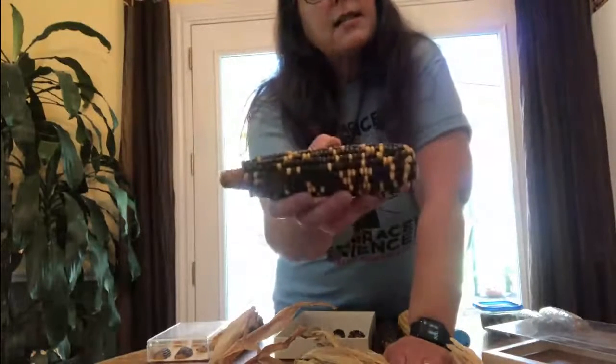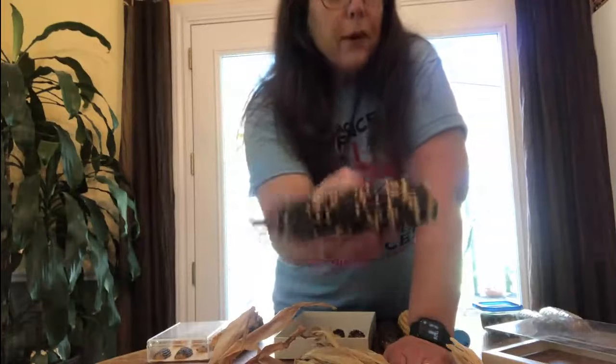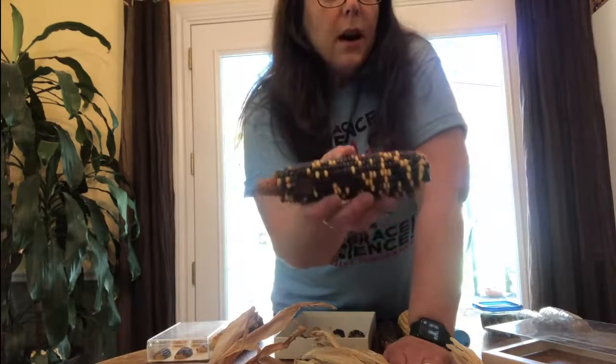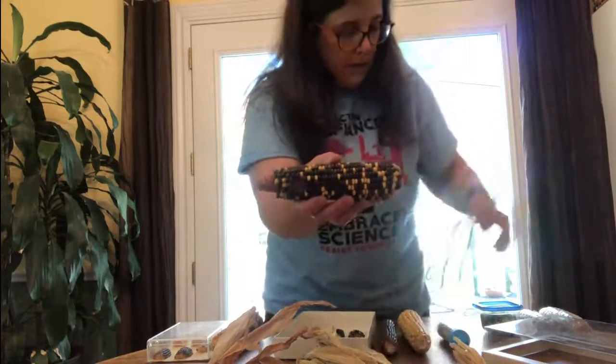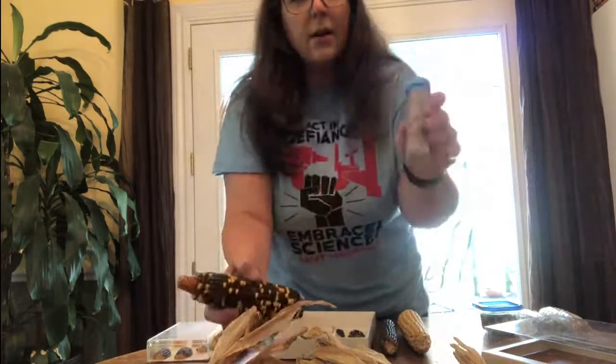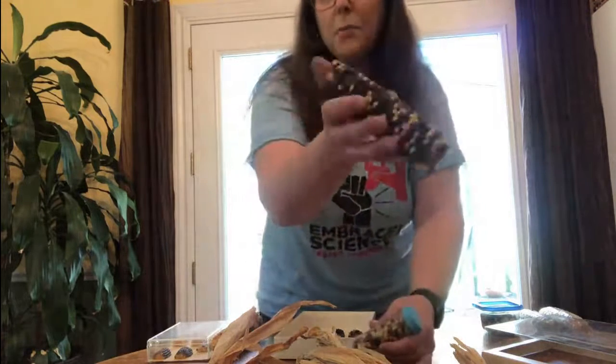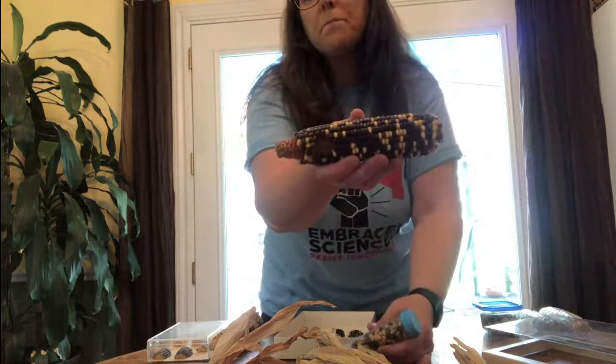And so we're actually going to take a sample from a cornfield. From the entire cornfield where this cross was accomplished, we're going to take a small sample that I have already pre-made. And so this sample should reflect pretty much what's going on here.